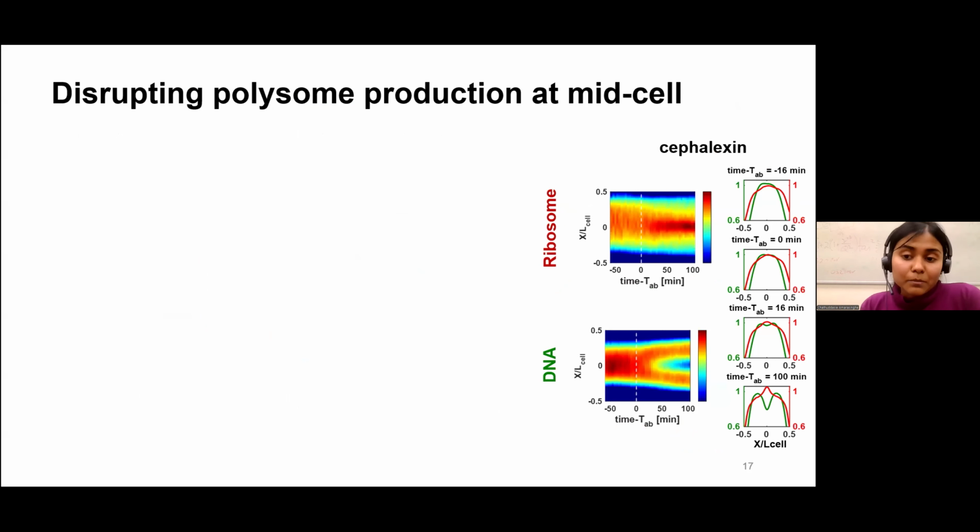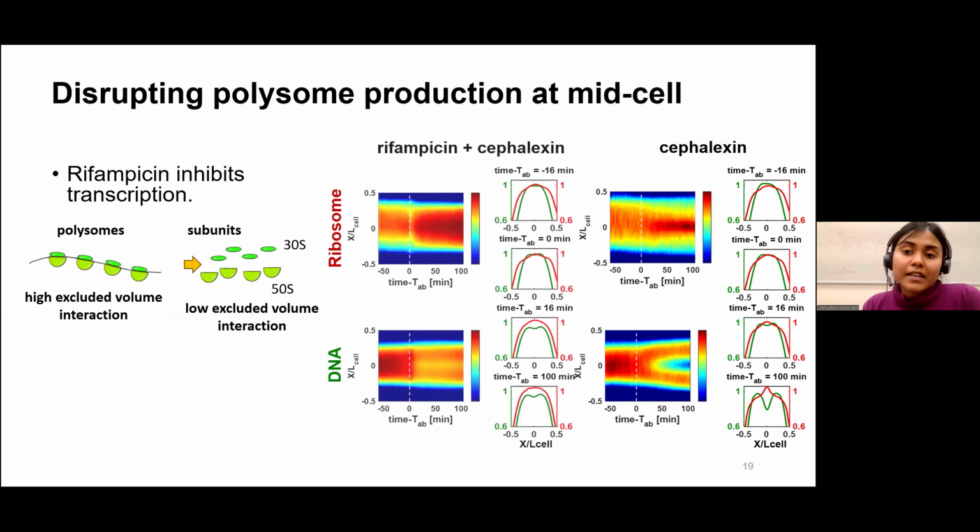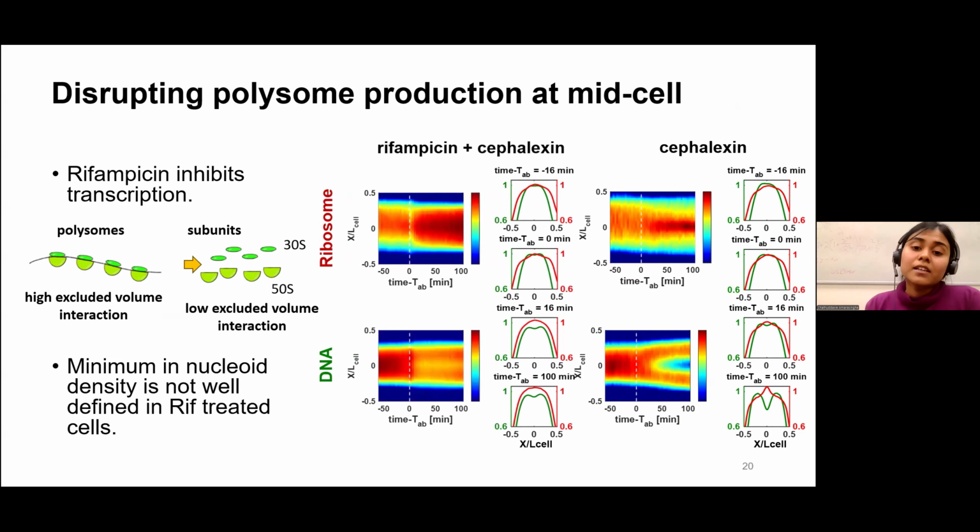And as the cell cycle progresses, ribosome intensity at mid-cell gets narrower and more intense. And corresponding to this high-intensity region, there is a low-intensity region at mid-cell in the nucleoid signal kymograph. And then using rifampicin, we inhibit transcription, and as a result, polysomes dissociate into ribosomal subunits. Due to their small size, ribosomal subunits will be uniformly distributed throughout the cell. And in these cells, the minimum in nucleoid density is not well defined as polysome production is turned off.